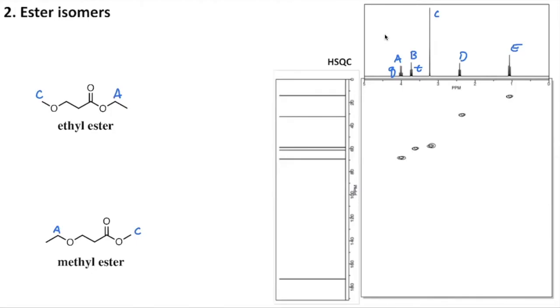That is probably this set of hydrogens here that we were looking at originally. So that's going to be B there, and it will also be B here. Okay, then we have D and E. Let's just keep going in alphabetical order.